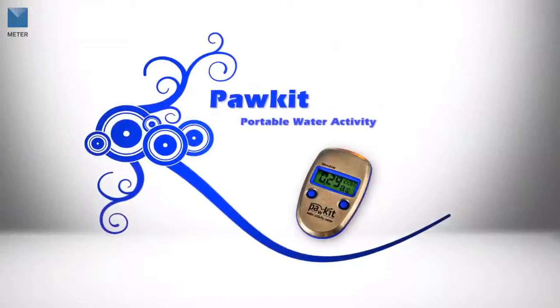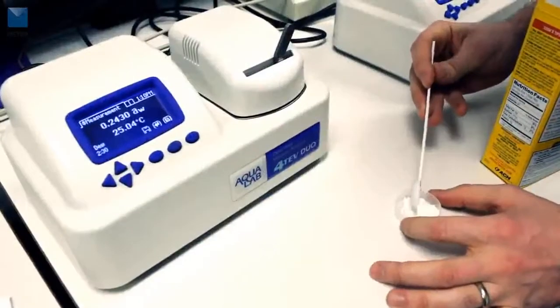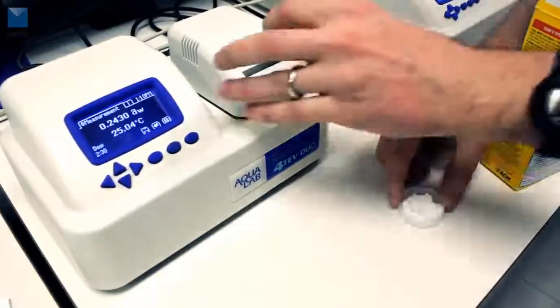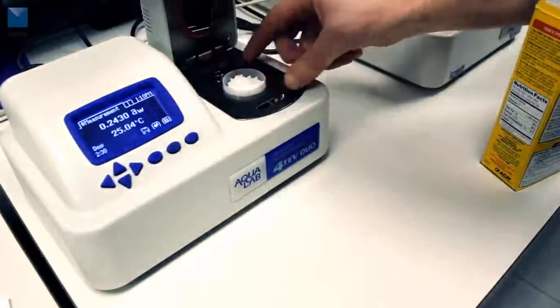The pocket water activity meter is an amazing instrument — it's extremely portable and can help predict the water activity of your products. If you're serious about quality, you probably already depend on a benchtop AquaLab instrument to produce fast and accurate readings.